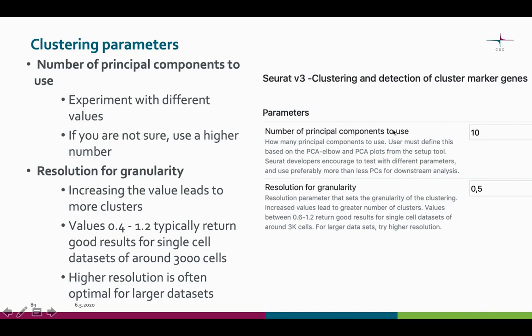The first parameter is the number of principal components to use. You learned in the previous video how to decide how many components to include, but you can experiment with different values — if unsure, use a higher number rather than a smaller one. The other parameter is the resolution for granularity. Increasing the value leads to more clusters. Values between 0.4 and 1.2 are typically good for single-cell datasets of around 3,000 cells. If you have more cells, you can try a slightly higher resolution.